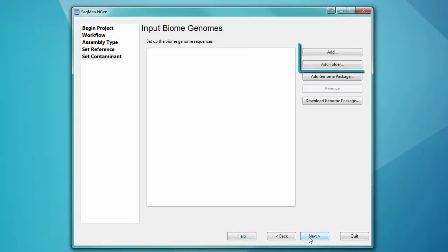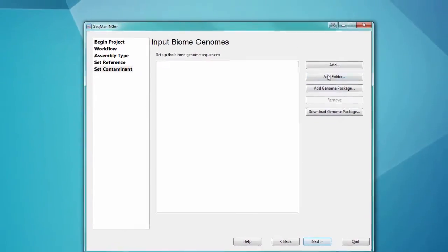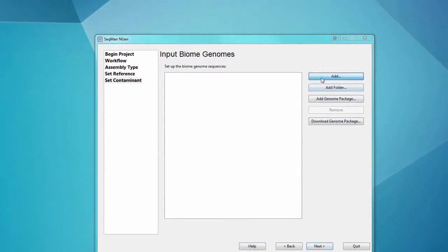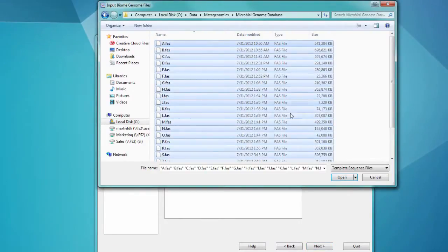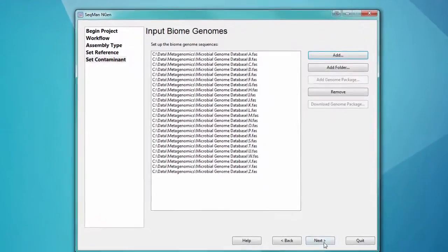Next, I want to load my biome genome templates. In this case, I'll be using the microbial genome database from NCBI, which includes thousands of annotated bacterial genome sequences.